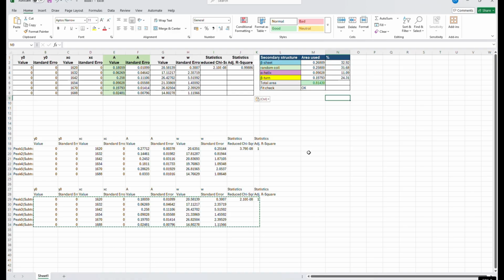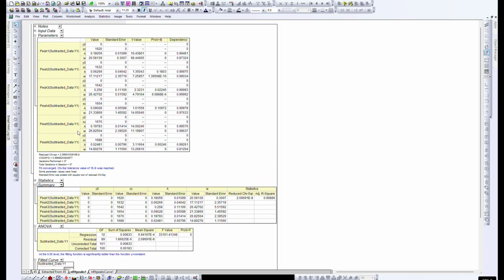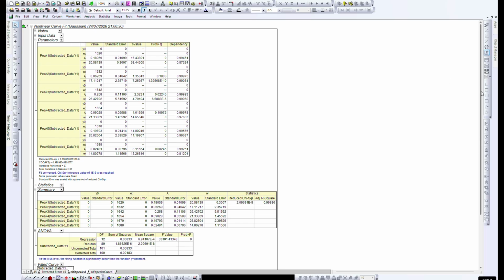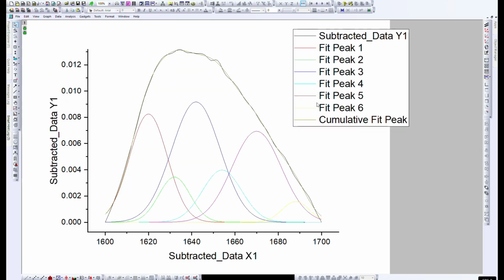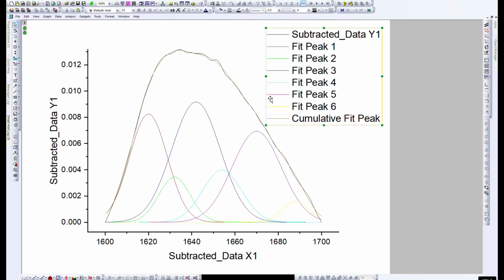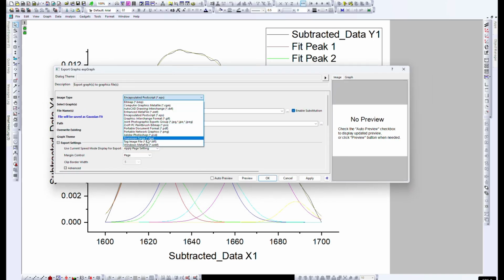So this is a very handy tool, the dialog theme option, and you can use the dialog theme option for anything. For example, if you want to save this image and export the graph, you have to select this again and again, and again and again select convert into PNG.